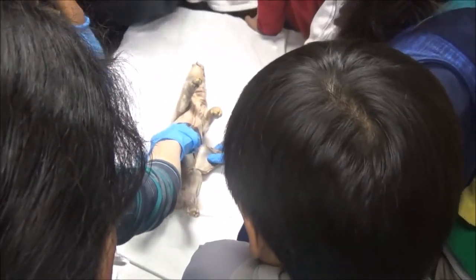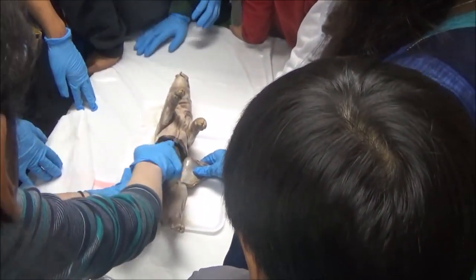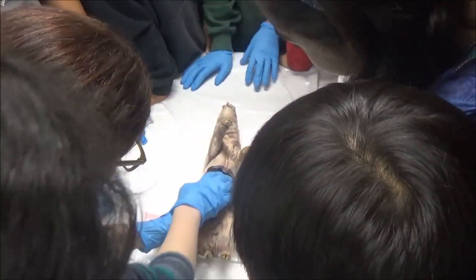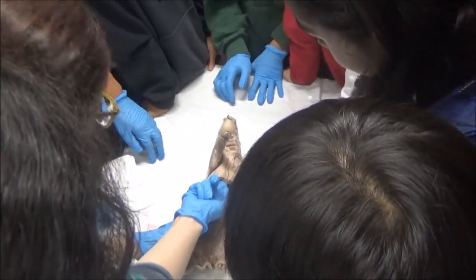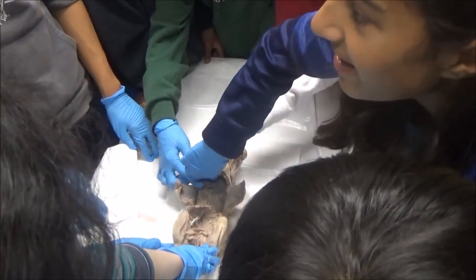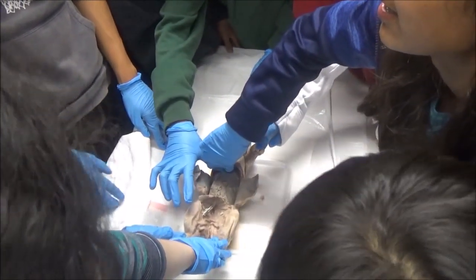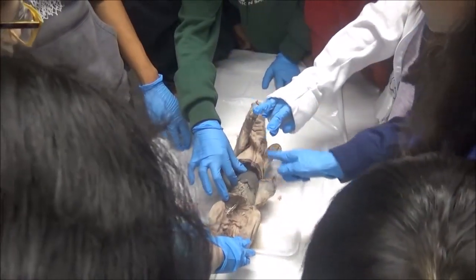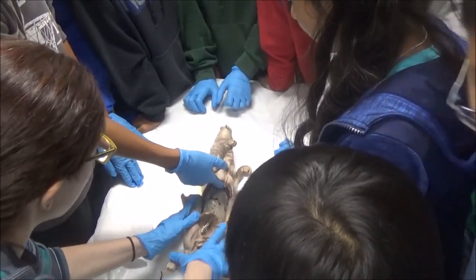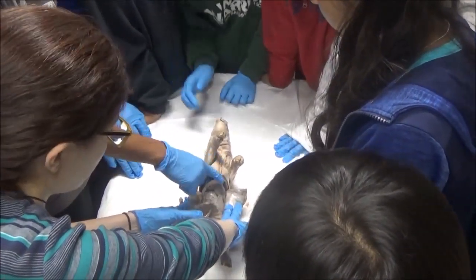So guys, you know what this big black thing is? The liver. The diaphragm's up in here. I'm touching it with my finger — do you want to poke it? How does it feel? Slimy? Slippery? Anybody who wants to put on some gloves and get their hands in here, welcome to do so.